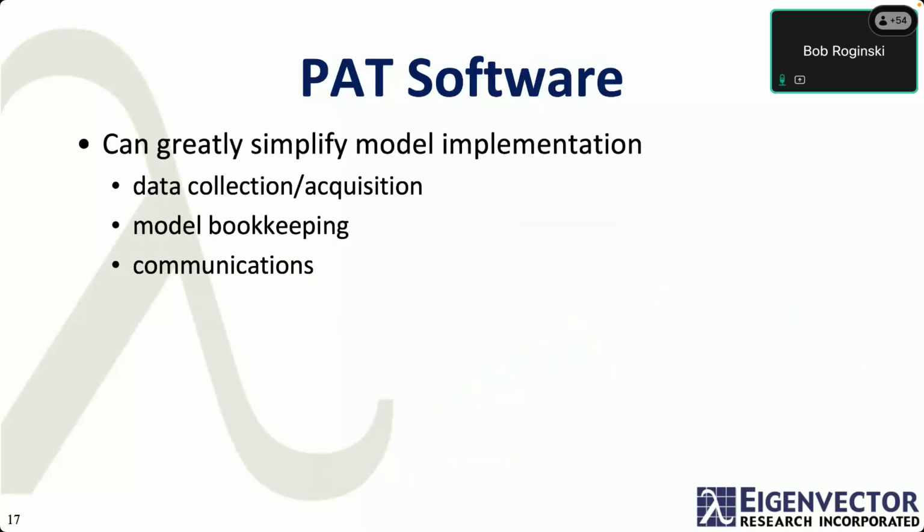PAT software can greatly simplify model implementation, especially in the last few scenarios, in terms of the data collection from all of your instruments, and perhaps from a data historian. In some cases, the PAT software can also be responsible for the data acquisition itself. It will help you with your model bookkeeping.